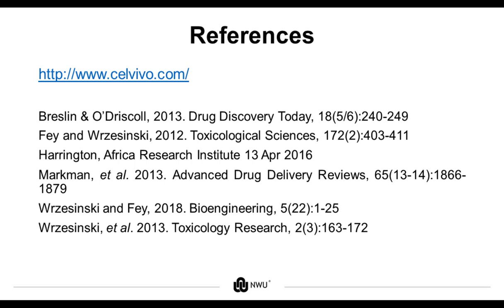Well, that question I can actually not answer completely as our results are still not published. We're still in the process of taking weekly samples for gene expression. But we would suggest that the gene expression would be much more stable in the spheroids than in 2D culture.